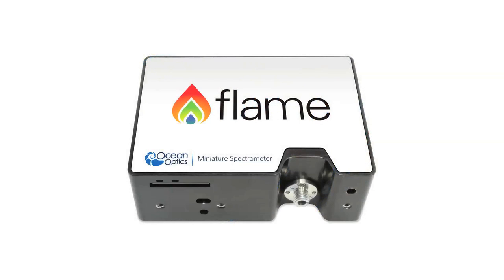The Flame S VIS NIR spectrometer with enhanced sensitivity is a powerful spectrometer in the palm of your hand. It's optimal for many kinds of reflection measurements. With high resolution and high throughput you can achieve superb results.